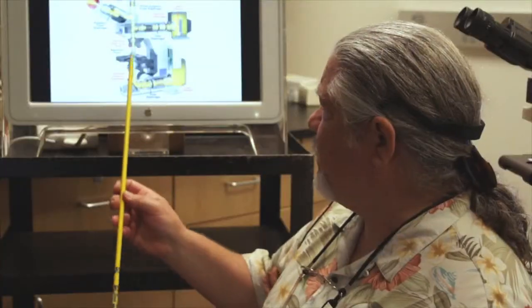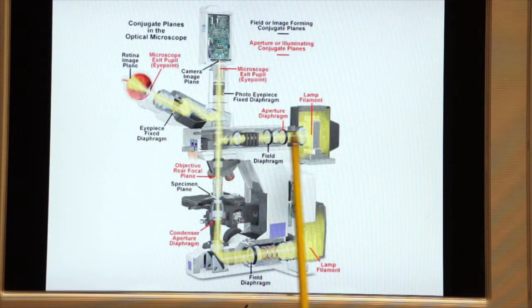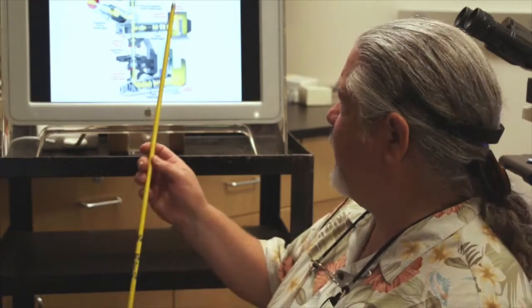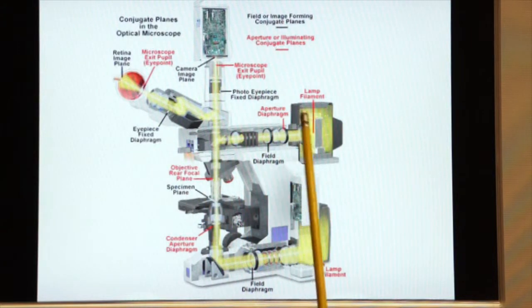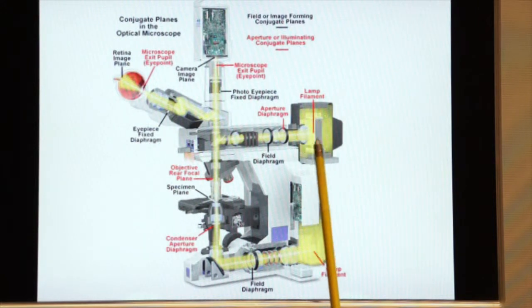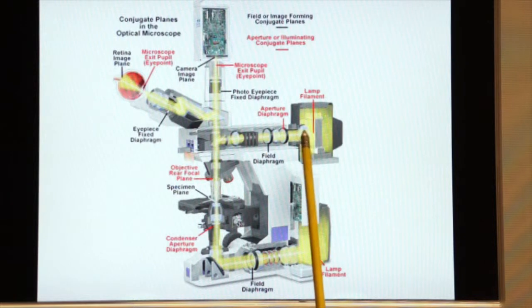So that's transmitted light. Now this microscope also does reflected light. Remember, in fluorescence, we're using reflected light to illuminate our specimen. So this is the fluorescent vertical illuminator. Here we have the lamp housing, which has that mercury bulb that we're going to discuss more in a few minutes. It produces a lot of light which travels through the vertical illuminator.